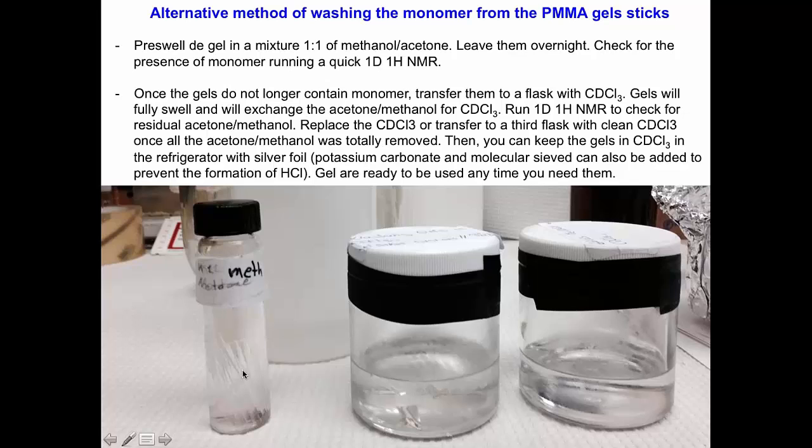The gels will swell halfway, and as they swell, the monomer will start to diffuse into the solution. You can do this a few times, two times, three times. And then if you want to know if the monomer is gone, you just take one of these gels, put it inside an NMR tube and run a quick proton, and then check if the monomer is gone.